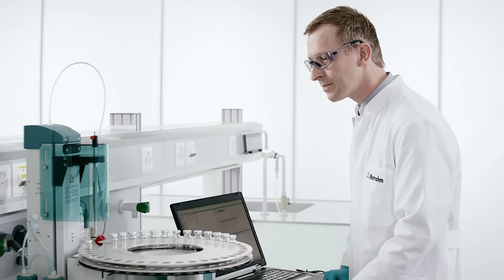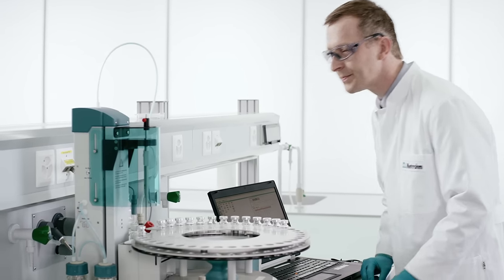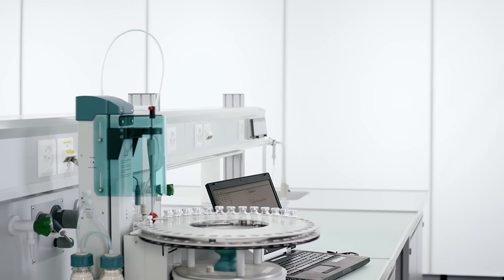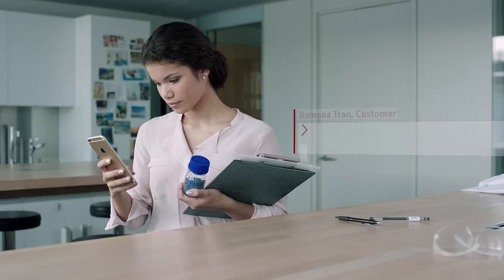Name any substance. We can determine the water content, however low, in practically any matrix.